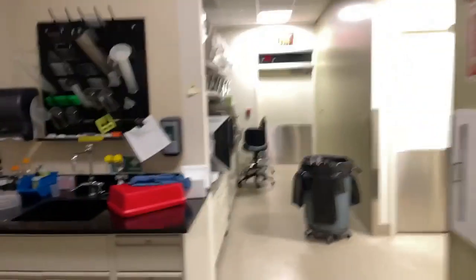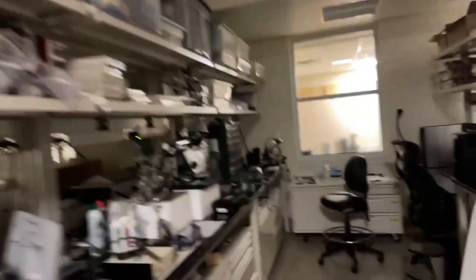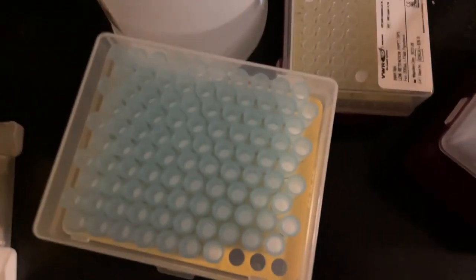Got any micropipettes? Of course we have micropipettes. We even have the weird ones with the screens, and then we have even older weird ones with the screens that do not work, and then normal ones. And we sprung for the fancy micropipette tips with the filters, and a centrifuge and a vortex. Gotta do that. Vortex my finger, make sure that it's well mixed.